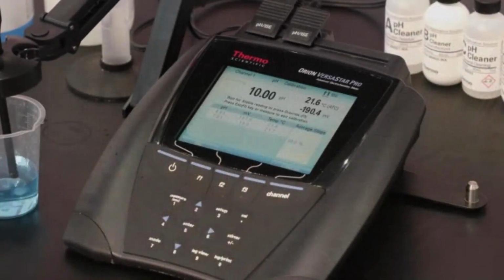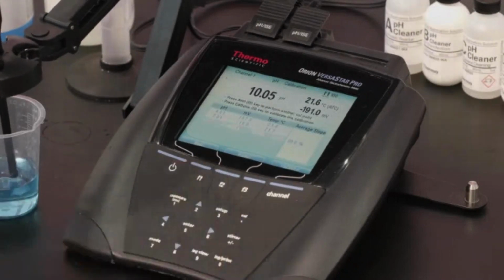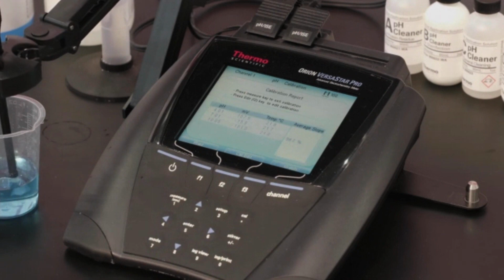He selects start, waits for the meter to identify the 10 buffer, and go into the ready mode. Once that's done, he'll accept that. And this isn't something we want to rush. We want to give plenty of time so we can have an accurate and stable calibration. And he accepts that, and we are done. So Steve, let's show the calibration results.